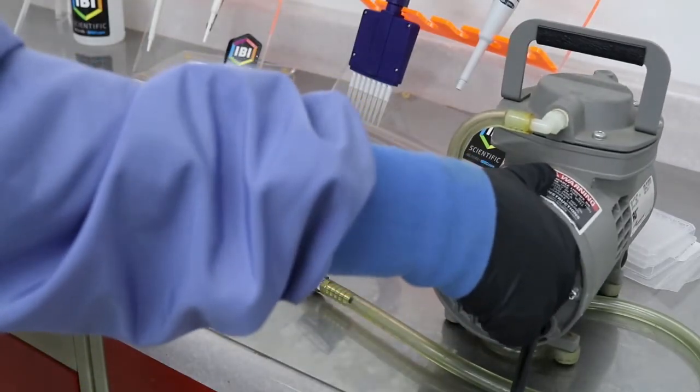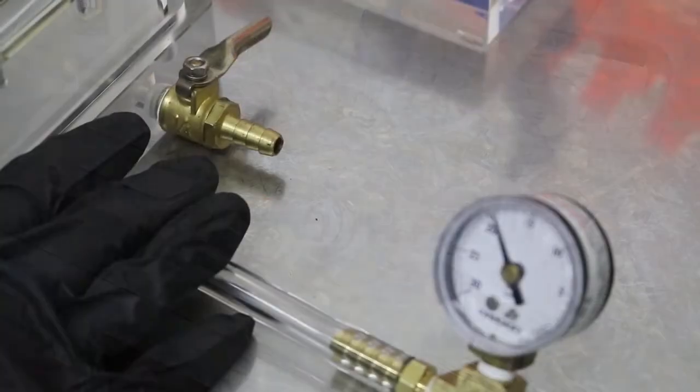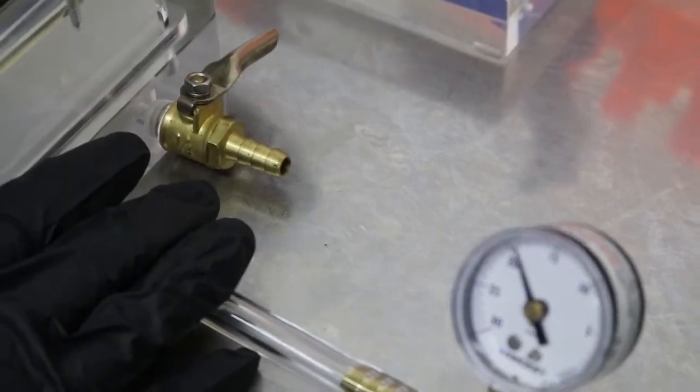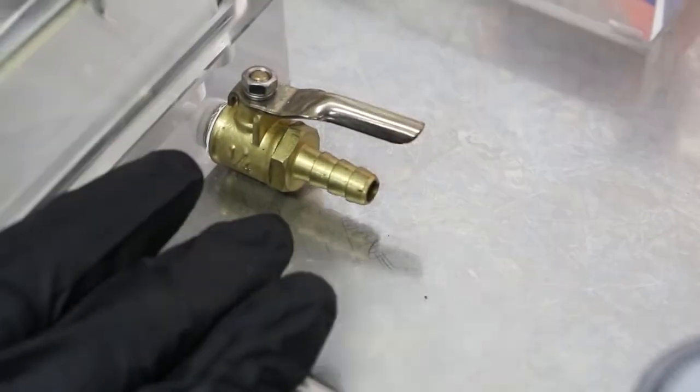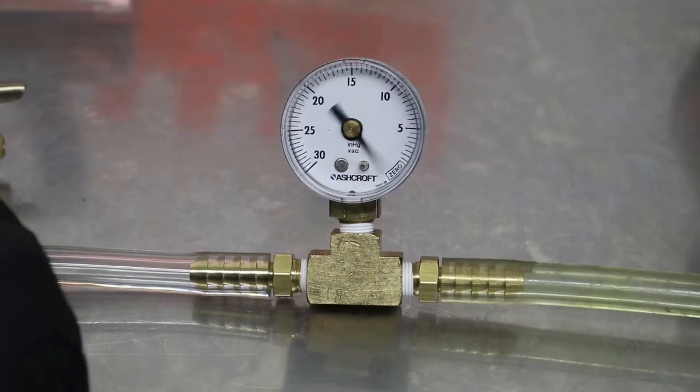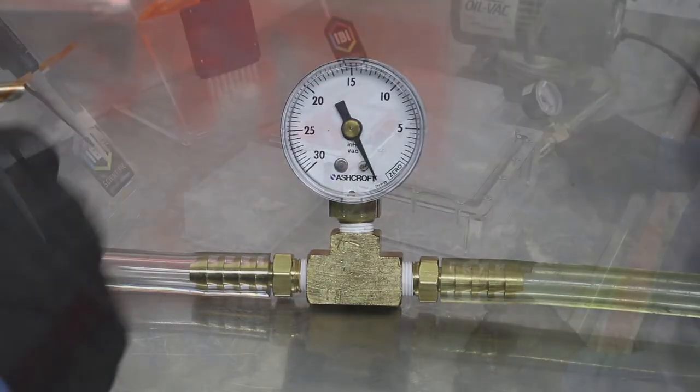Once the sample is dry, turn the vacuum pump off. Next, open the release valve to release all of the pressure. It is best to return the pressure to zero before removing the binding plate.